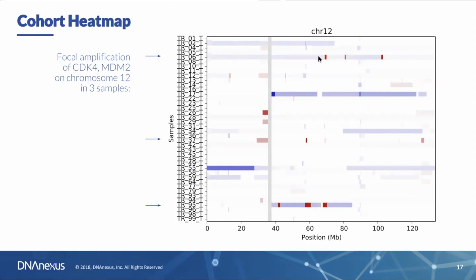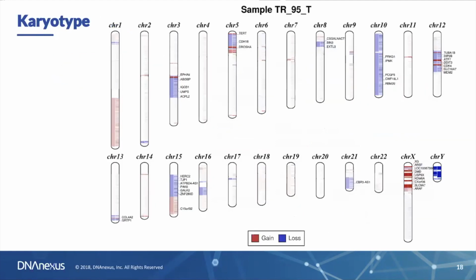So what are these recurrent alterations? We're going to use another plot type, the scatter plot, to understand that better. But first we're going to look at the diagram. This is the chromosomal diagram or ideogram that I mentioned. Just another way of viewing the heat map, this time with gene labels.